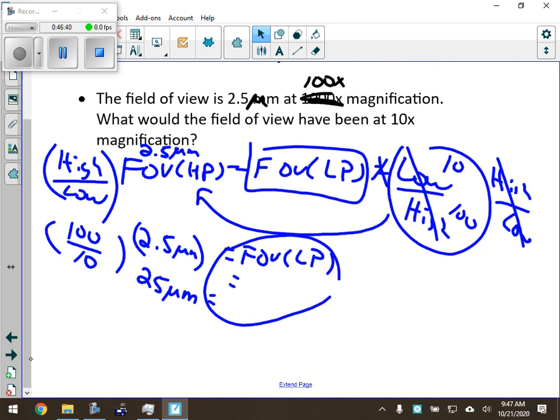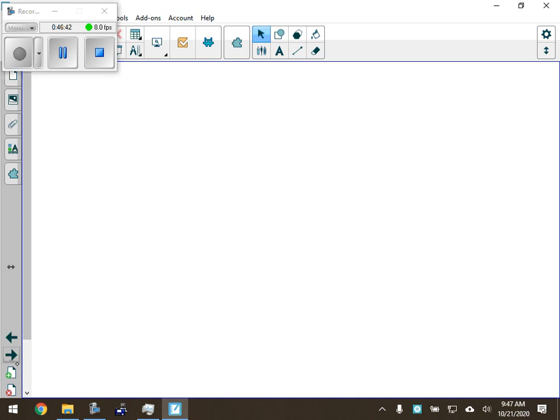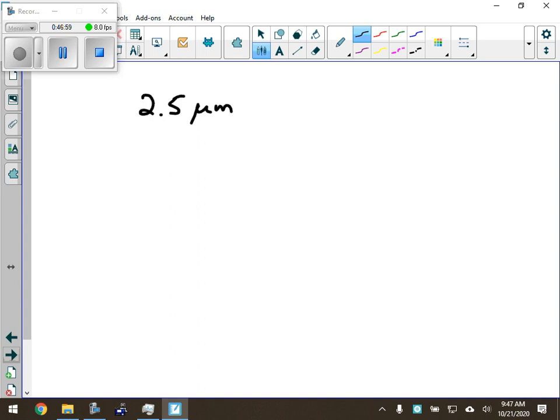Okay. Now, here's the deal, okay? And I don't care how you want to think of this, but you can also do this. I mean, do you have to use the formula? No. Just make sure you understand what's going on here. So let me just reiterate this. It's 2.5 micrometers at 100 times. Okay? What's the field of view at 10 times? At 10 times, what is this?